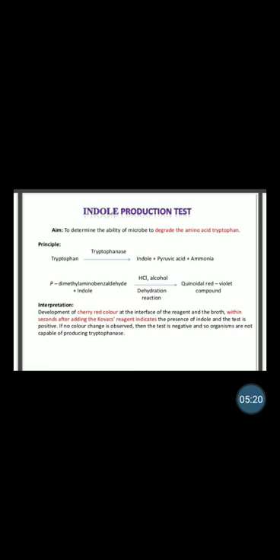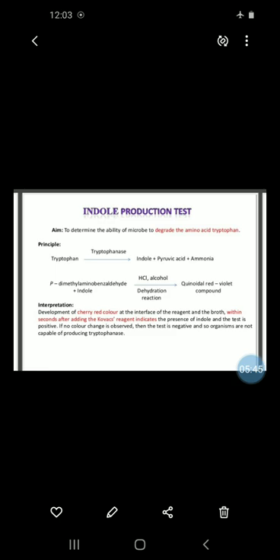Then we will see the principle of this test. Tryptophan, in the presence of the enzyme tryptophanase, gives indole, pyruvic acid, and ammonia.